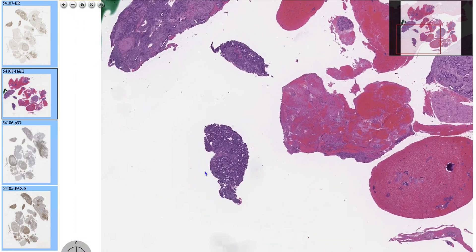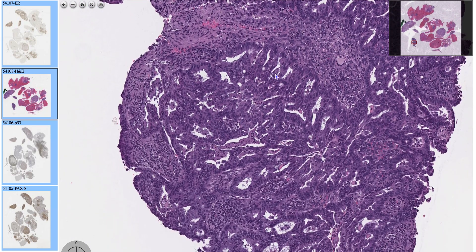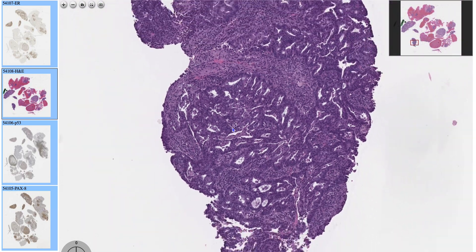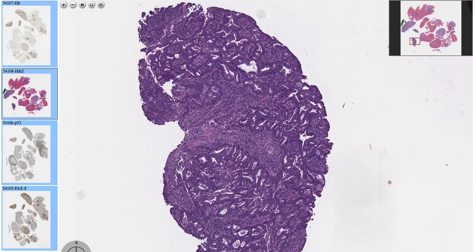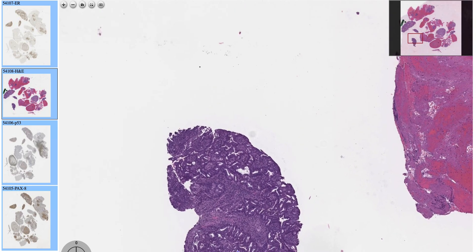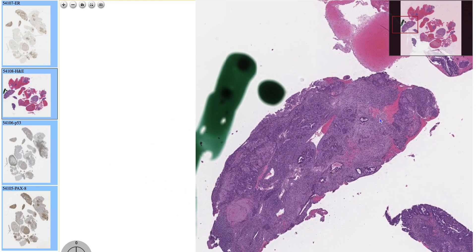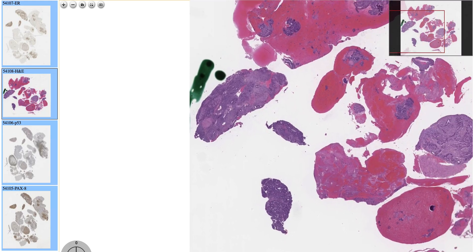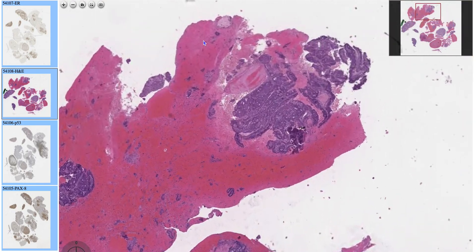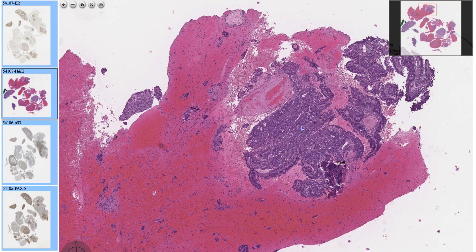But as you can see here, you can see cribriforming — kind of these sieve-like spaces. You can see meandering of the glands, these glands that kind of never end. And so this is endometrioid endometrial carcinoma. Your telltale features are this cribriforming as well as meandering glands that just keep on going on and on.